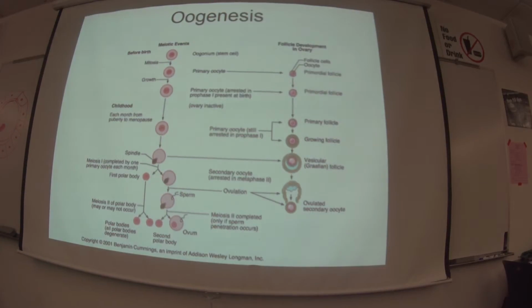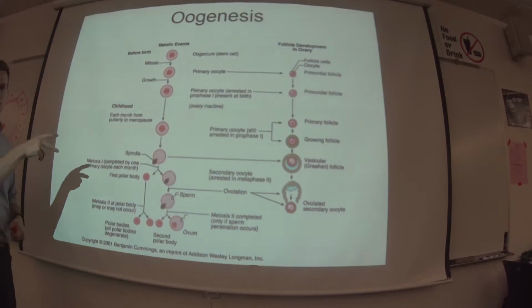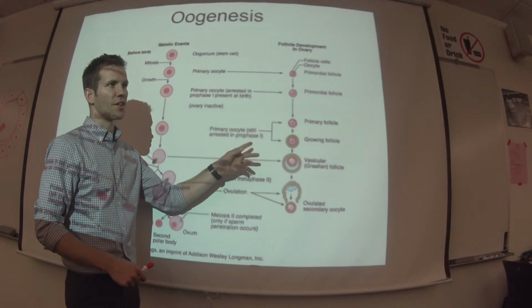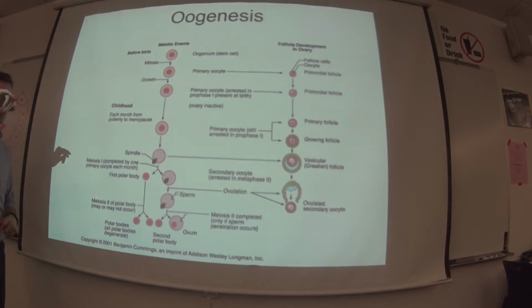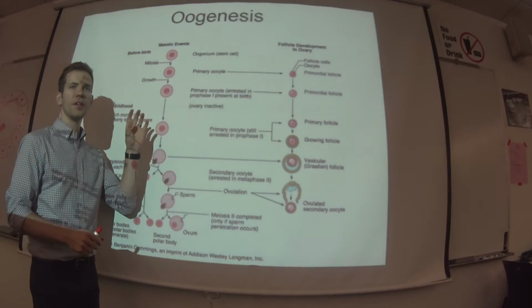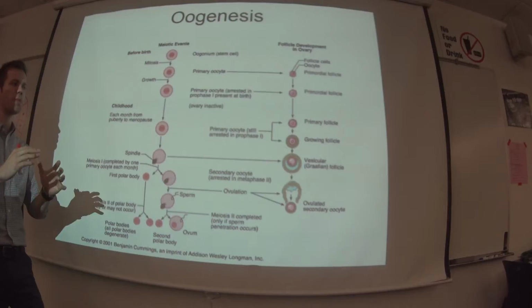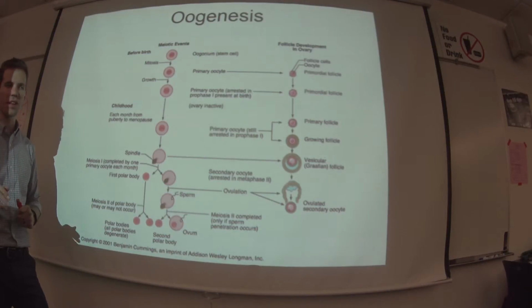And it's huge. It's also like 5 times bigger than any other one. So again, we'll look at those two. Secondary, we'll look at all of these in a moment. But the differentiation between secondary and mature is probably the hardest one. You have a question, Morgan? Probably you're about to show us some histology. Okay, yeah, we'll look at all this and practice picking these out because it's a continuum here. It's a growing thing, and we're kind of isolating primary, secondary, and mature. Those are a little bit hard to pick out, but we'll practice a couple times, and then it's not so bad.